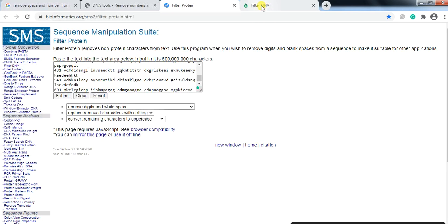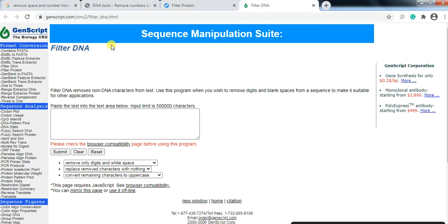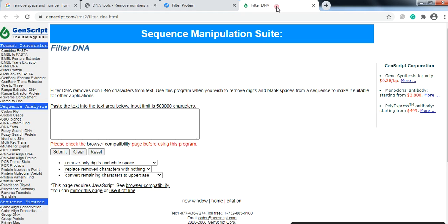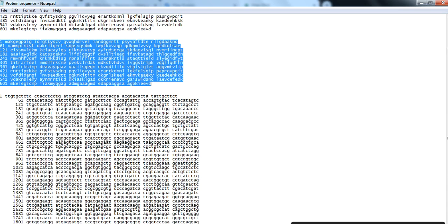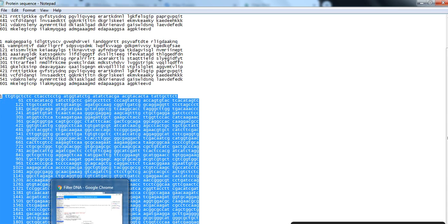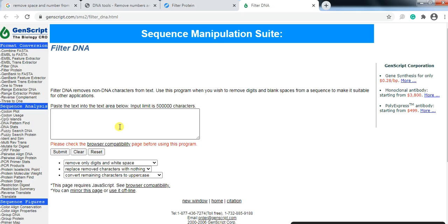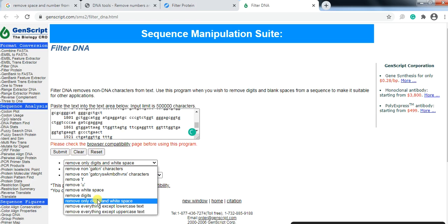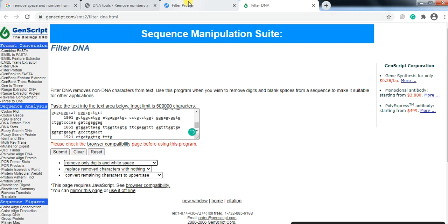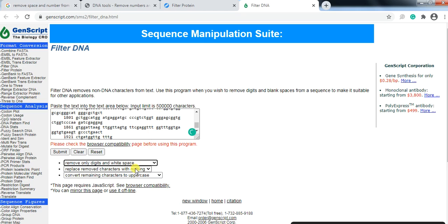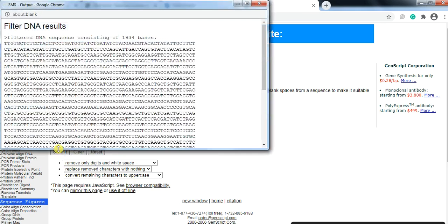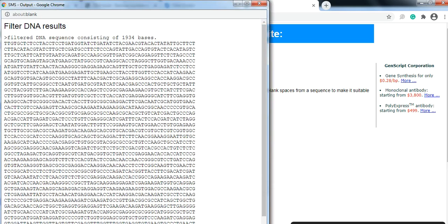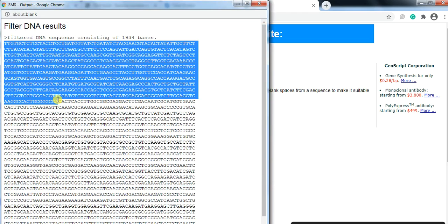Here is another one, the Filter DNA. It is like the Filter Protein but here you can use the DNA sequence. Like this one is my DNA sequence so I copy it and you can paste here and here you also have the options like we have used during filtering protein sequence. And then you can submit it and get that sequence in uppercase and you can copy it and save it into your document.